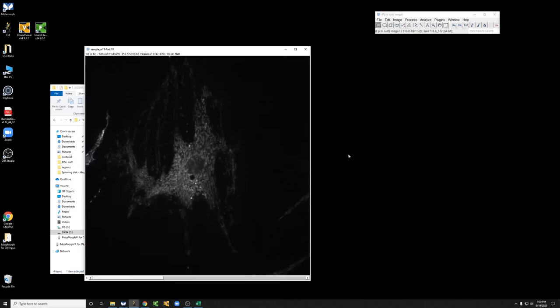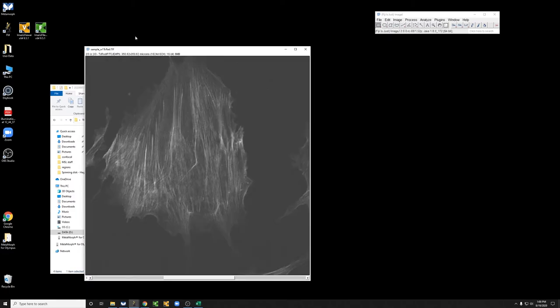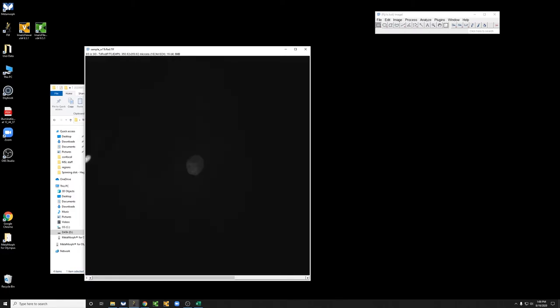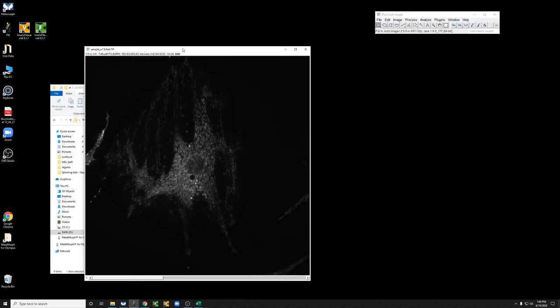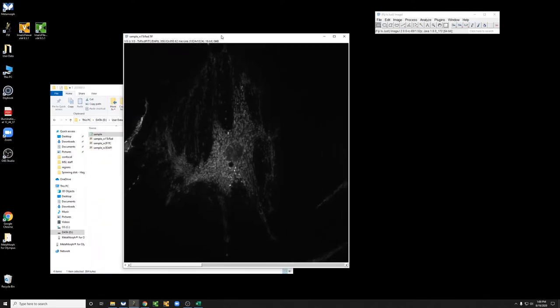We just say okay, and here we have the image which you can see. Fiji understands that there are three channels, and it also knows what the size of this is in physical dimensions.